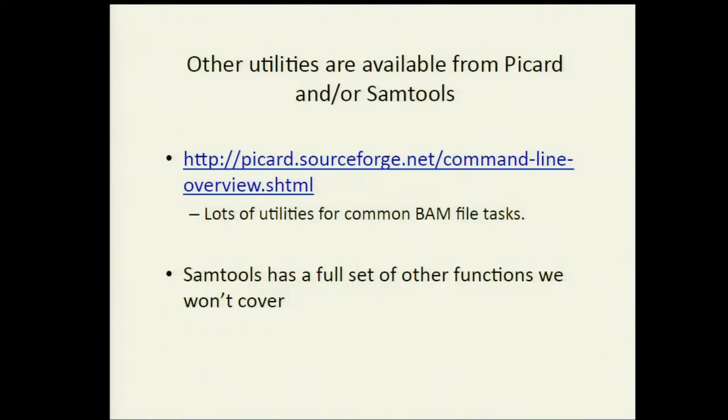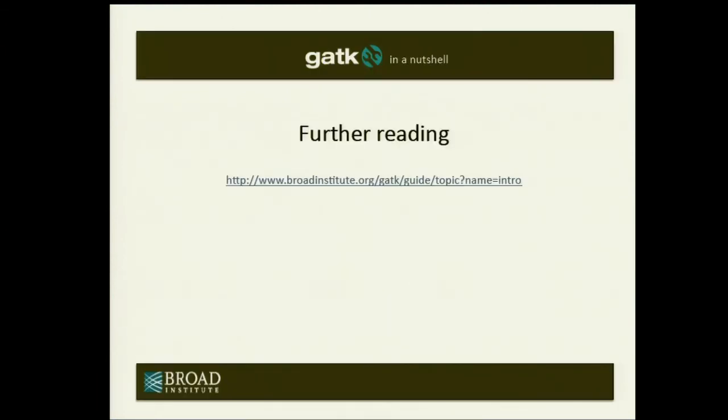Finally, I should point out that we don't write all the tools to process next generation sequencing. In particular, I like to point out the Picard set of tools and Samtools, which we use also. They have a lot of nifty tricks and tools available. So you should check them out if you're really going to do any processing of sequencing data. And that's it.